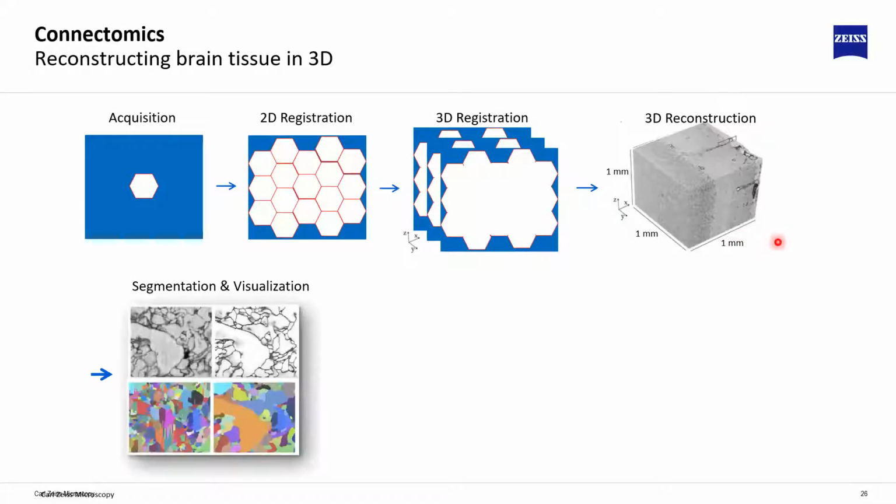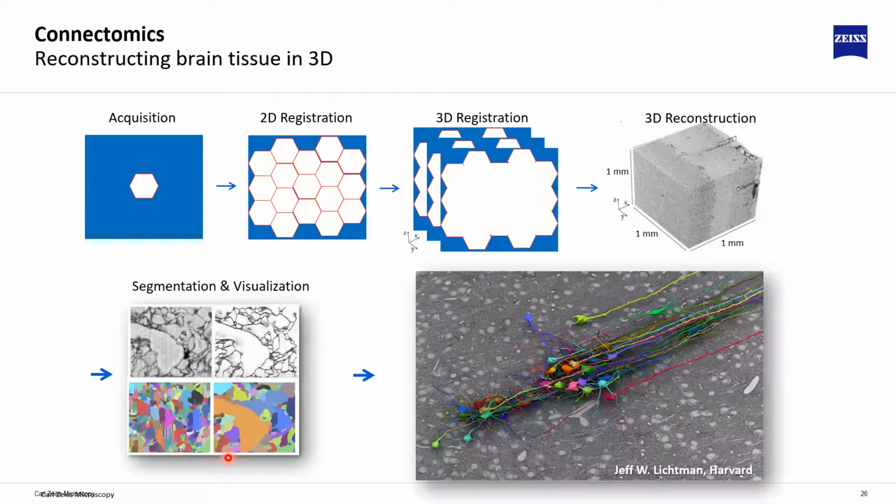The biggest challenge of those workflows now, at least in my eyes, is to make sense of the data. I think the bottleneck of your electron microscope generating these 3D data sets is pretty much solved, and it's quite mind-boggling how much data they can actually pull out. The biggest challenge and bottleneck at the moment is segmentation and visualization, actually making sense of the data. And that is where I would say the dramatic majority of the focus is sitting at this moment.